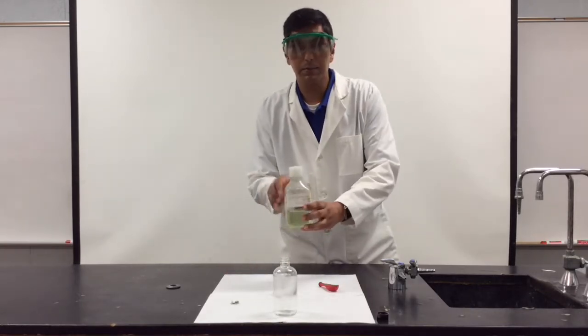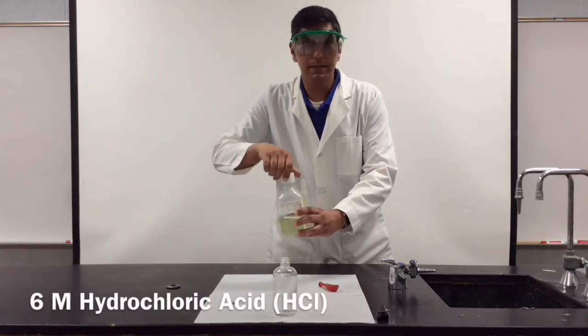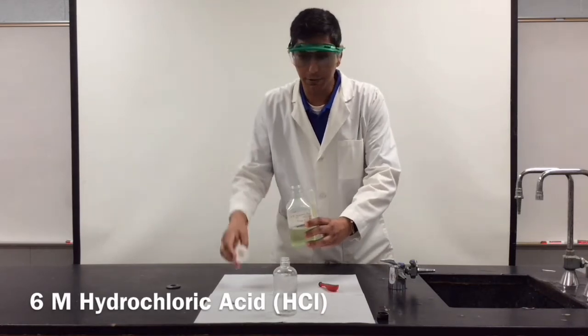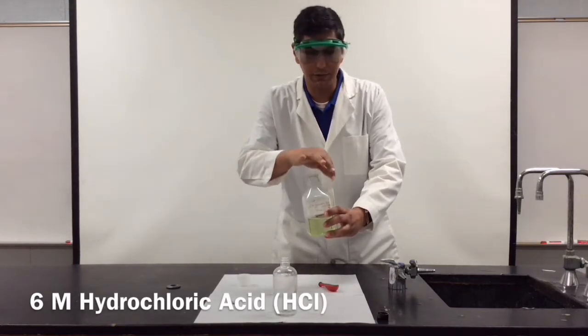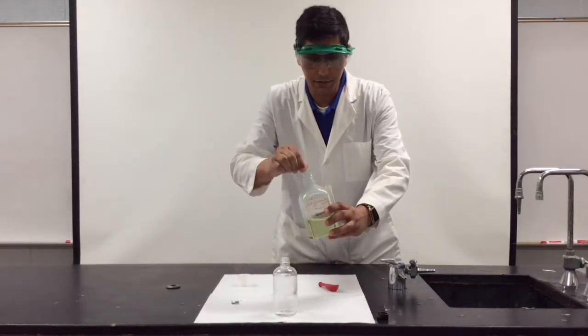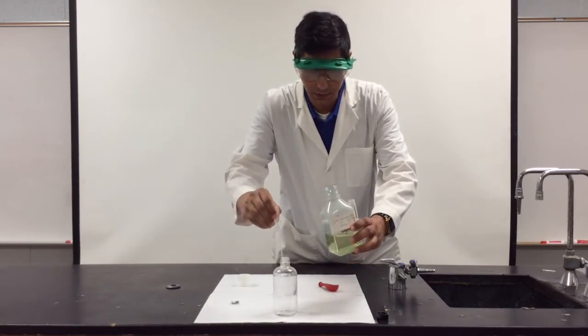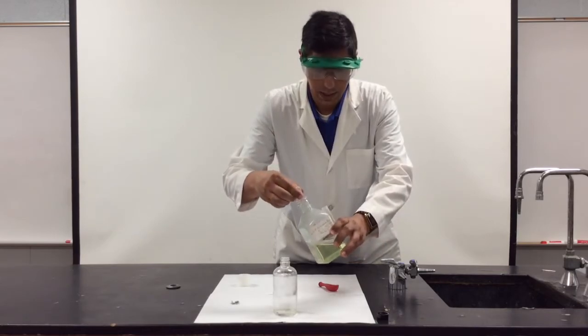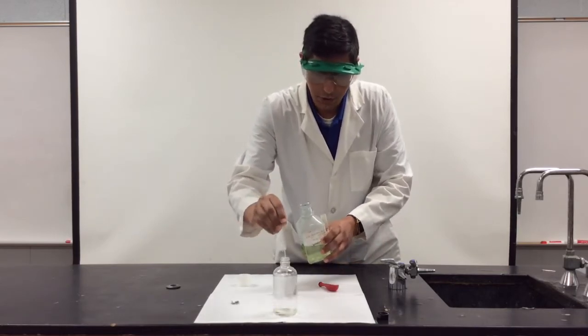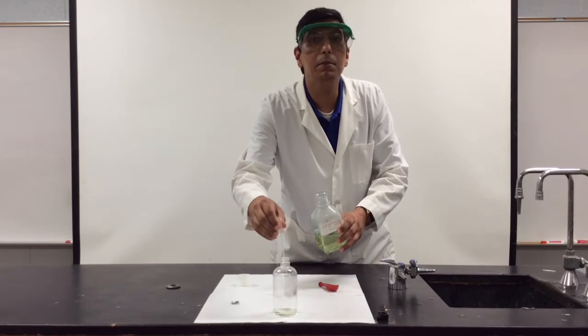Now today we're going to be taking some hydrochloric acid. This is six molar hydrochloric acid so it's relatively concentrated. I'm going to put about four milliliters of this into a glass bottle and to that I'm going to add zinc metal.